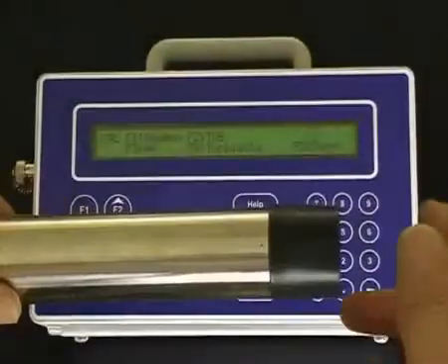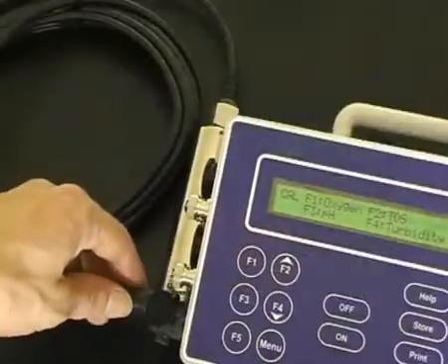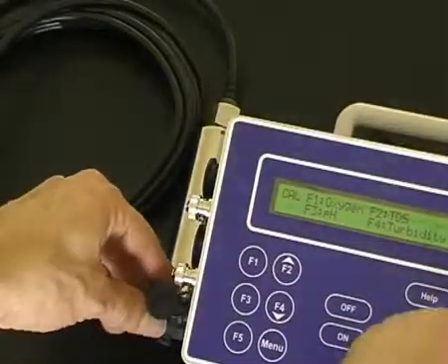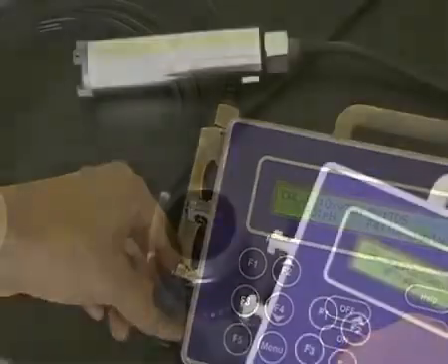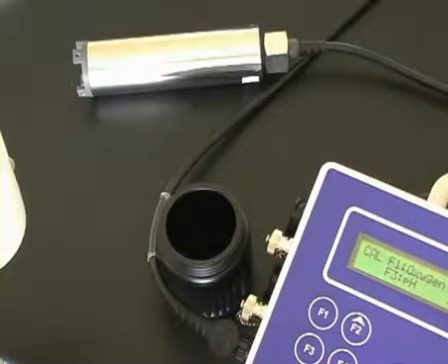To calibrate the turbidity sensor, first remove the protective cover from the sensor. Connect the sensor to the turbidity socket on the 90 FLT. The first point calibration of the turbidity sensor is performed in deionized water in a black jar.